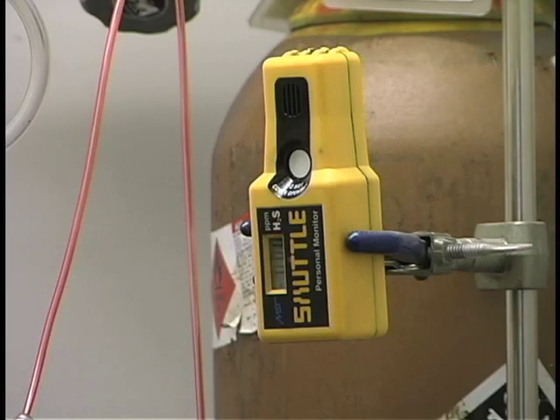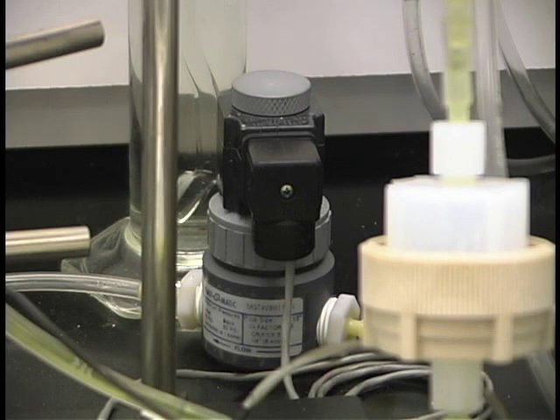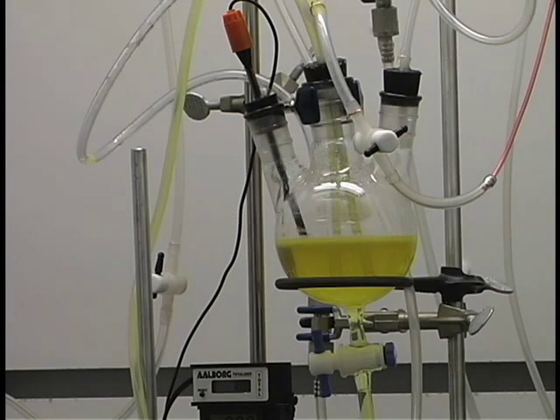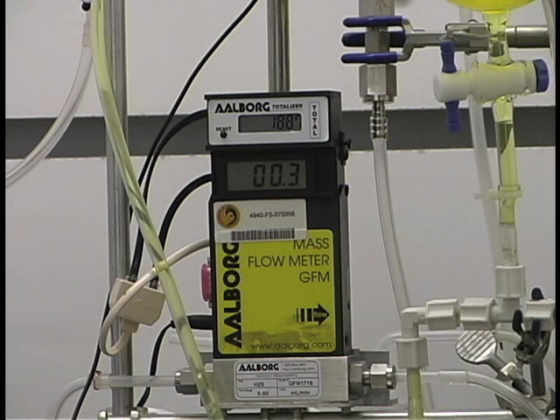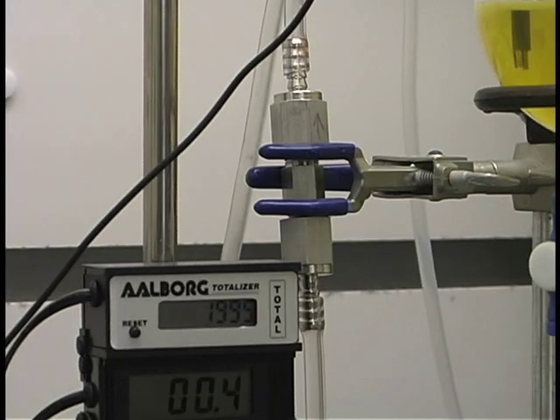The sensor is electrochemistry based and gives off an intermittent beep at 10 parts per million and continuous above 20 parts per million. The darker object in the middle toward the rear of the area shown is the H2S flow controller. In order to use only as much H2S as is necessary to balance the chemical turnover in the photoreactor, this flow controller is coupled to the pH in the scrubber vessel. We have also installed a flow monitor and integrator into the H2S supply line so that we can quantitate the amount of H2S flowing into the system. A check valve in the upper right prevents scrubber solution from backing up into the monitor.